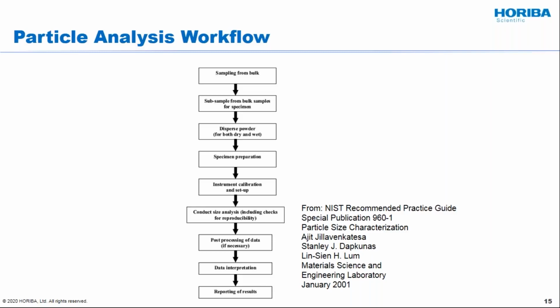Once you've got that all completed and verified, now you're ready to conduct your measurement. In most cases, again, you're not going to just accept one sample. You're going to want to do proper statistics to get the best possible data. You're going to collect the data. You're going to do some processing of that data. Then you're going to get to the point where you have to interpret the data. Again, we'll spend a little time on that. And then last but not least, reporting your results.